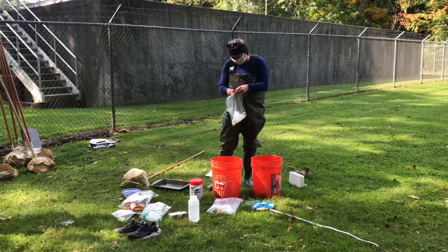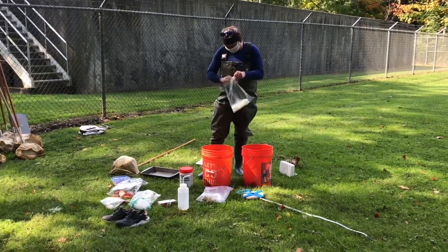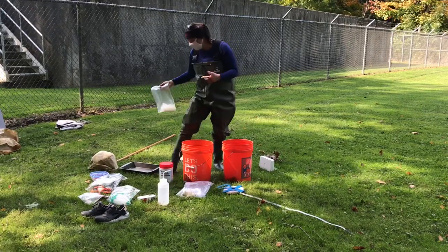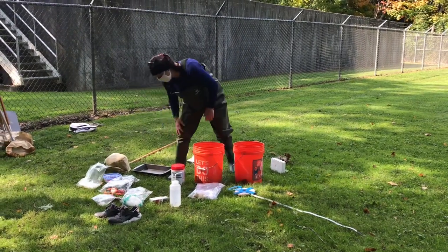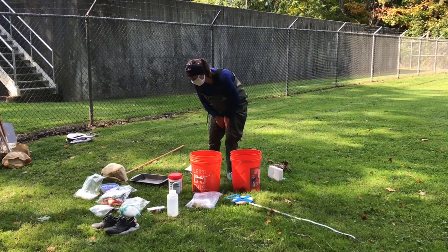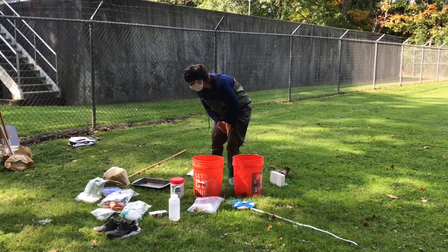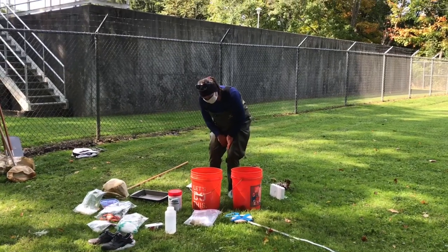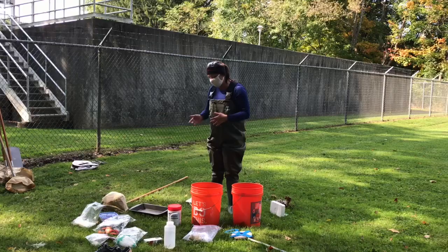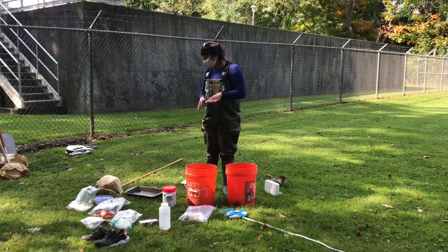Sometimes people like to use pipettes or spoons to help capture, so take one of each and see what you like. I think that's it with the sampling. So again, if you need more than one vial, that's just fine. Just make sure you label it correctly.